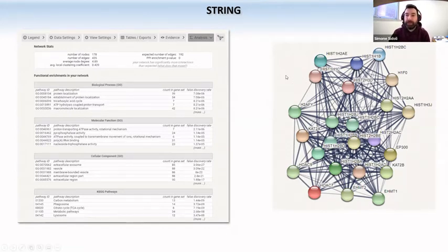And this type of cluster, from my perspective, I would not look at them protein by protein, especially because they can be very big. But they can be helpful, for example, to help you identify, like I said, a cluster of proteins. There is an entire group of proteins that are all involved in this specific interaction.